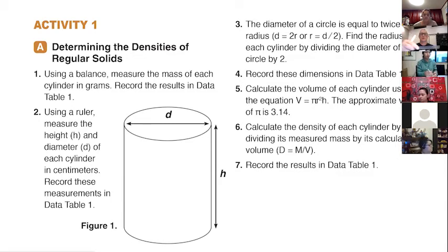Now on the ruler, I don't know if you'd be able to see this very well, but on the metric side, since we're going to be using the metric side always, the larger units are centimeters and the smaller units are millimeters. So you can see in between 1, 2, 3, and 4, those are centimeters. And there are 10 markings inside each centimeter.